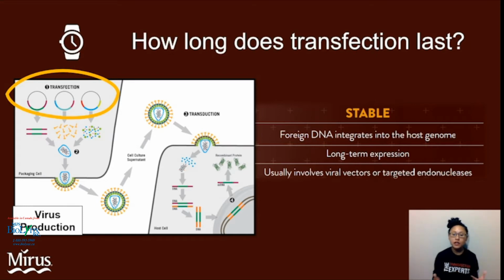And depending on the virus, once the cell is infected, the virus can integrate its packaged genome into the host genome. And the cell can then express stably that viral gene, which is often your gene of interest. So if you're having trouble directly transfecting your cells and selecting for stable expressors, you might want to consider an approach like this, using lentivirus-mediated transduction to create a stable cell line.